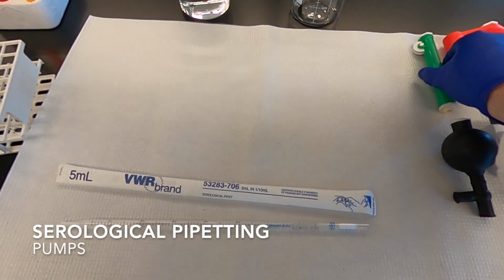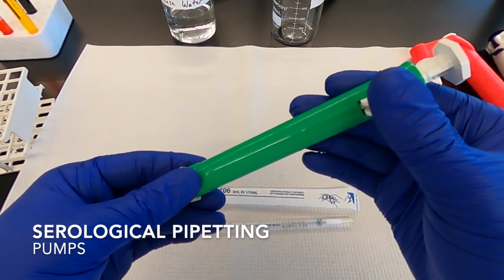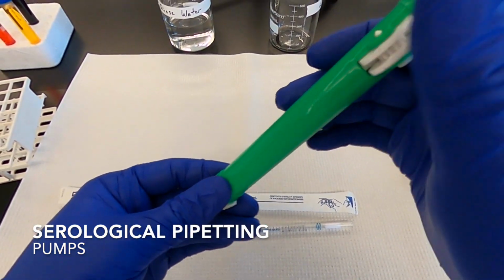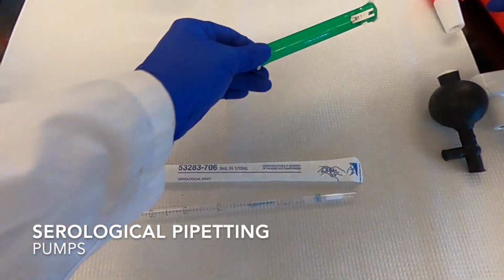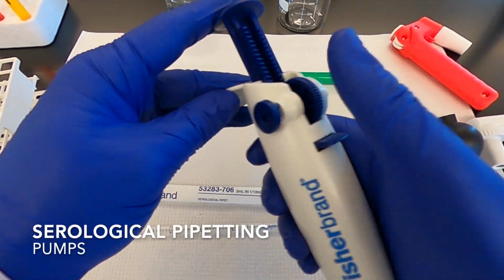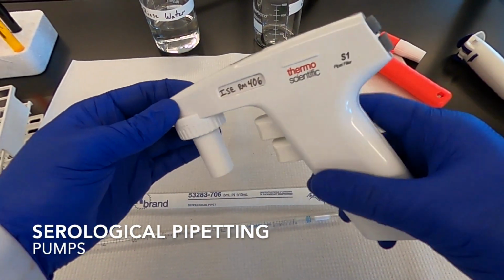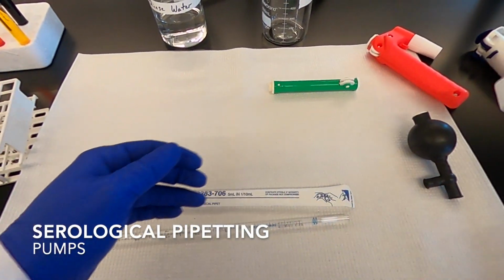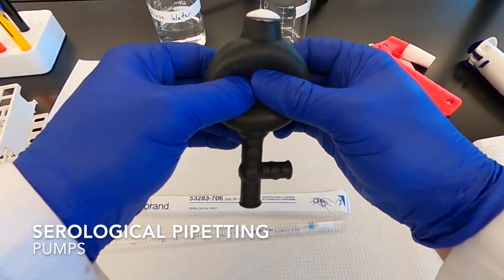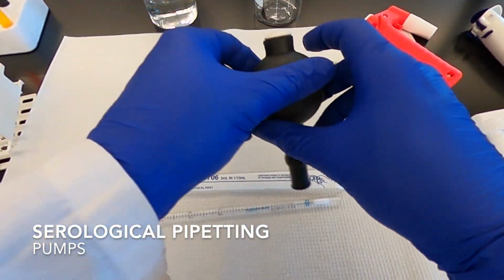Next we have the pumps. So pipettes use pumps to help aspirate and release liquids from them. A sliding pump, exactly like this one, is common in learning labs. They're cheap, they're efficient. We also have other variations of it. In research labs, they tend to use electrical pumps, so-called pipetters, like this. Or in older settings, you might see these bulbs, which you can use to very cleanly and precisely pipette.